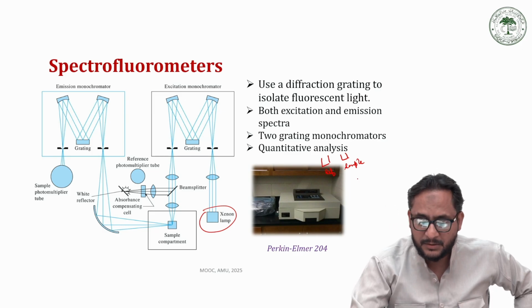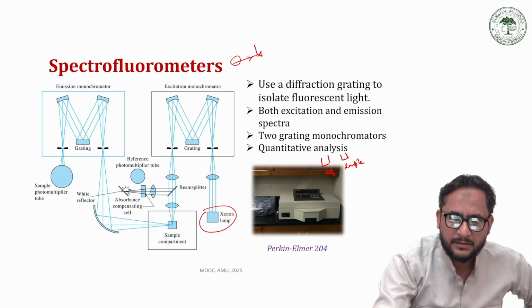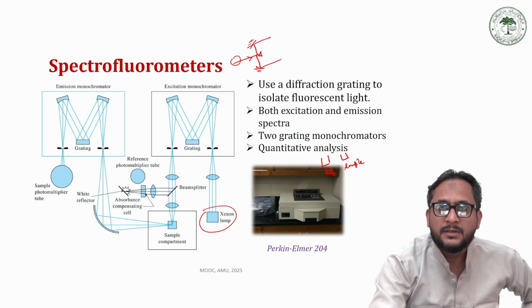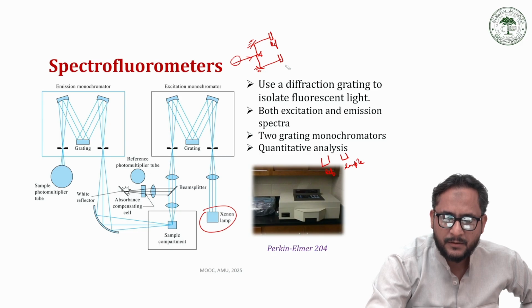The light radiation that is being created by the light source goes straight, and then there is a prism which divides this light radiation into two different light radiations of equal intensity. Then we have mirrors, then we have a focus mirror that turns this light radiation at 90 degrees. Finally we have two slots, one for the reference cuvette, the other for the sample cuvette.